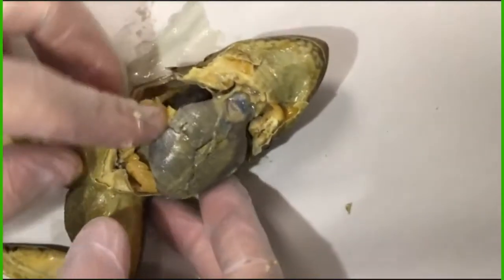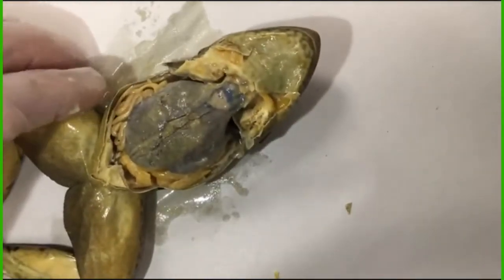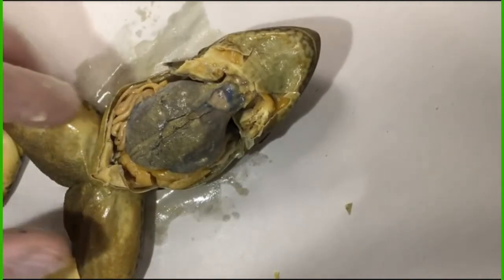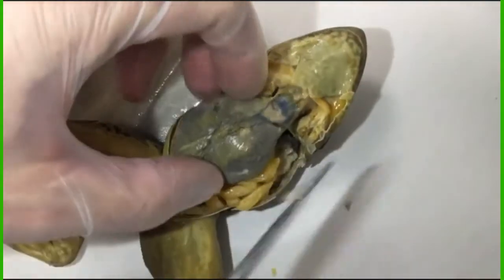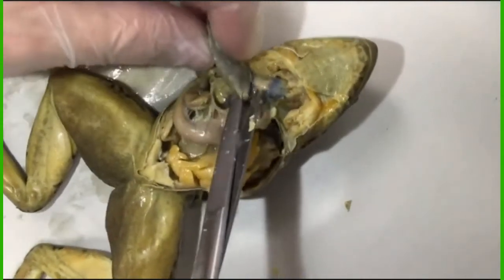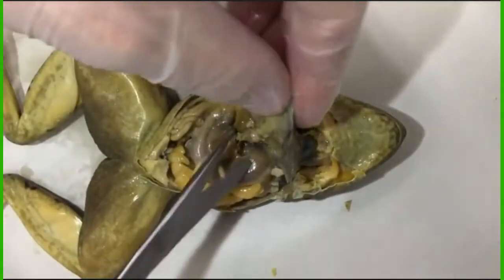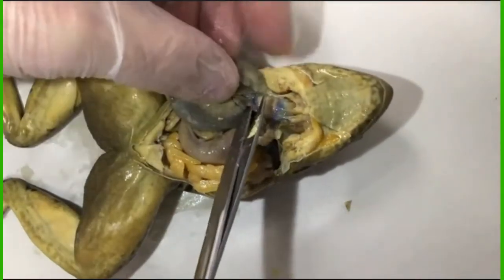Cut that muscle and skin all the way over to the side. And now you can see all the organs we need to see right there in the front. That big organ that you see right at the front, that's the large three-lobed liver. Okay, and so usually the first order of business is to get that out of the way, because until you do, it's hard to get to any of the other organs. So we're snipping underneath. There's some really thin tissue that connects it to the body cavity, and it's easy to get around that and snip away.